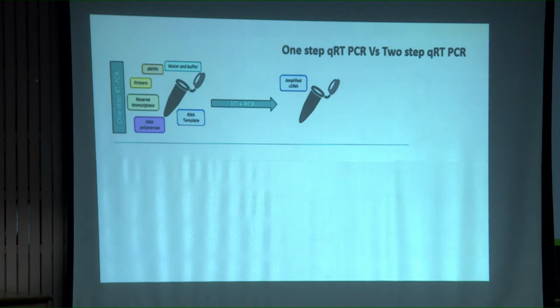In a single step, you mix everything together, and you expect the RNA to get converted into cDNA, and the cDNA to get amplified along with a probe-based or dye-based detection. You are going to monitor them using cameras and a spectrophotometer.